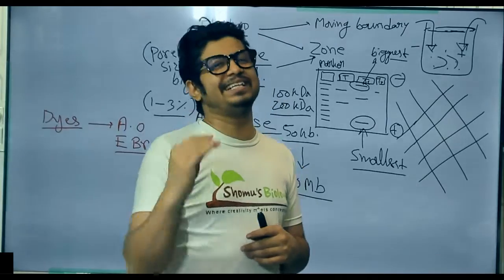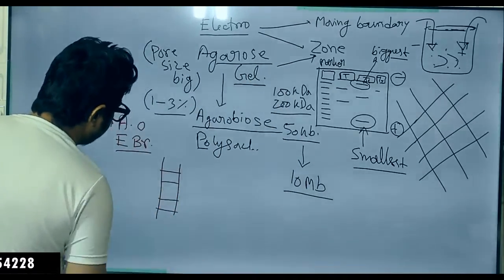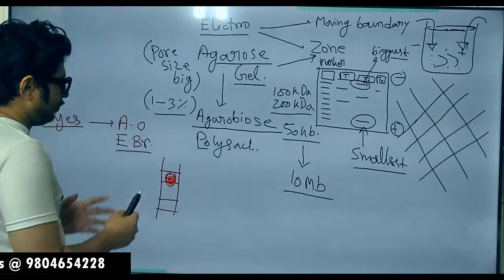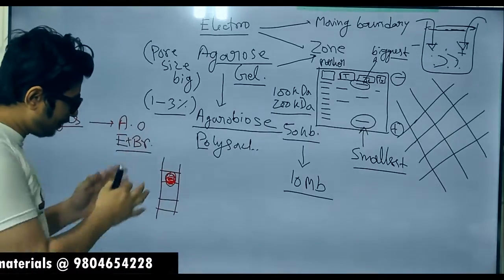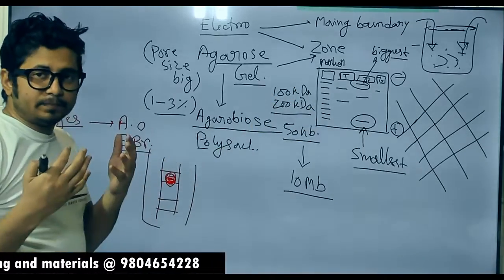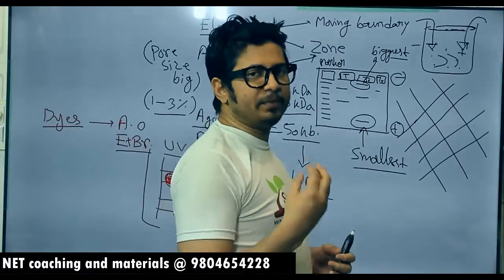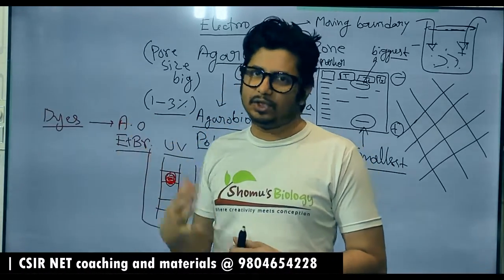Generally, they are base intercalating agents. So if we consider DNA as a ladder-shaped structure like this, these dyes stack themselves between the base pairs of the DNA. And once we add them, for example, ethidium bromide, EtBr, and then we put this whole agarose gel plate in a UV chamber, then this DNA can be visualized as an orange color due to the presence of the UV light.